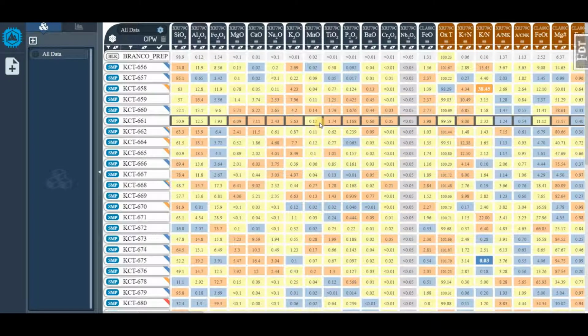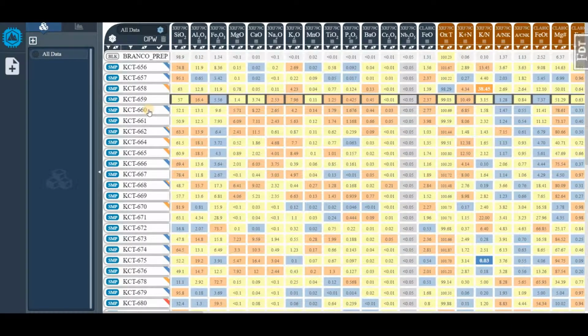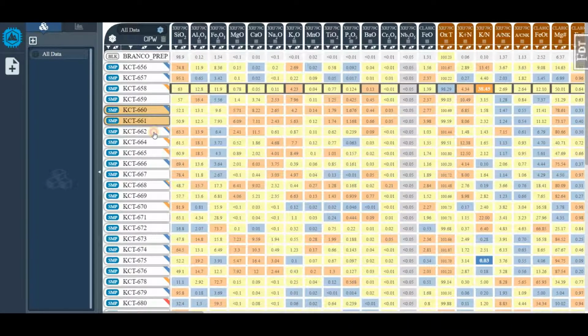Hello, in this video I will show you how to create sample groups. To select a sample, click on the cell with the sample name. Selected cells will change the color to orange.